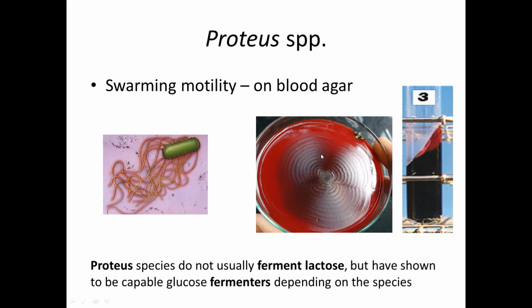It's another one. If you do motility testing using peptone growth and the agar test that I showed, you can see nice motility. Also in KIA, the slant is alkaline but the butt is acidic, and it produces hydrogen sulfide, H2S, but is not a gas producer. You can see peritrichous flagella, which are involved in movement. And it is a non-lactose fermenter, that's why the slant appears alkaline.